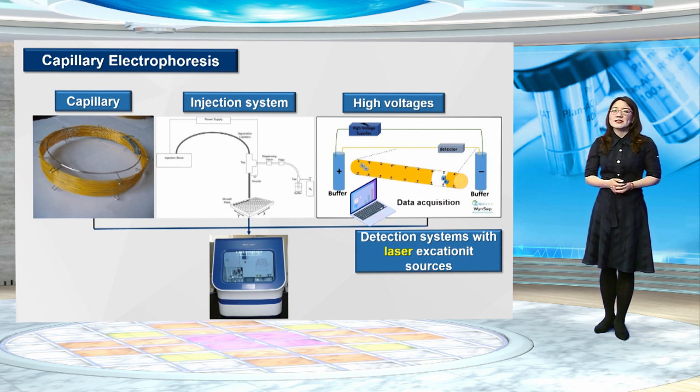During the electrophoresis, the capillary is connected to the buffer vessels that are connected to the electrodes. The injection of the samples is performed by an autosampler, whose injection is based on the charge of the molecule. Only a small quantity of the sample is required for each injection, and any remaining sample can be reused.